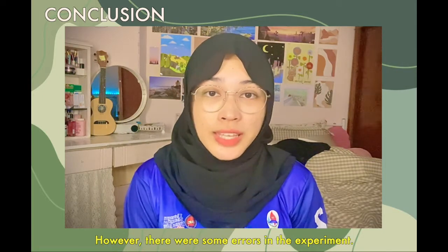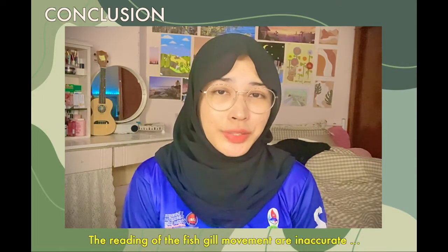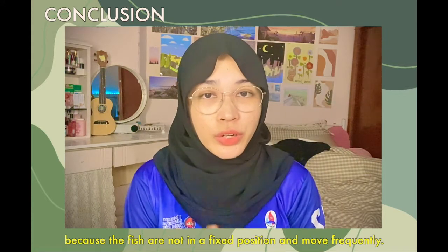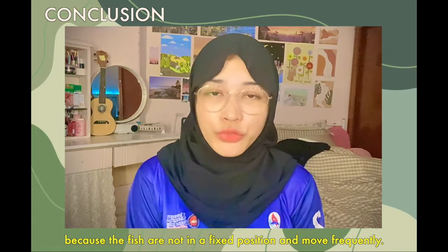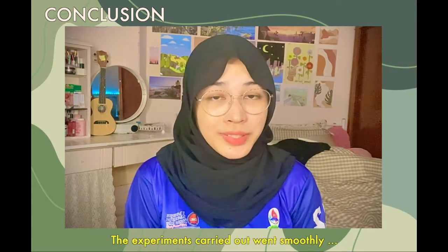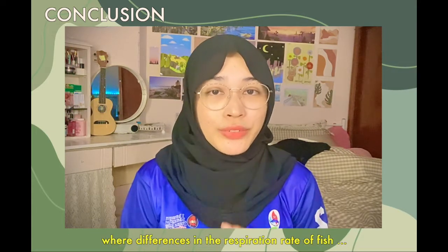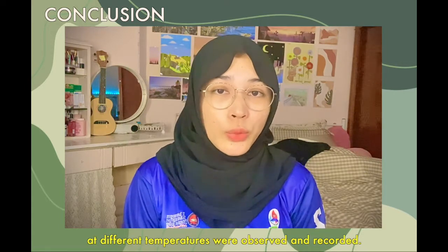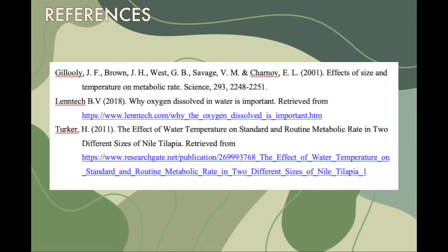However, there were some errors in the experiment. The readings of the fish gill movements are inaccurate because the fish are not in fixed positions and move frequently. The experiment carried out went smoothly, where differences in the respiration rate of a fish at different temperatures were observed and recorded.